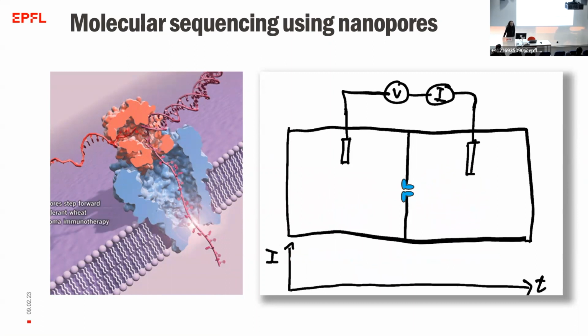Similarly to the nanopipettes, we can also think of the nanochannels in biological pores or solid-state nanopores as small holes through which ions are passing, but also sometimes a single molecule can pass through. As ions are modulating this base current, that Georg also nicely showed in his signal generation, the current can also be modulated once the molecule passes through the pore.